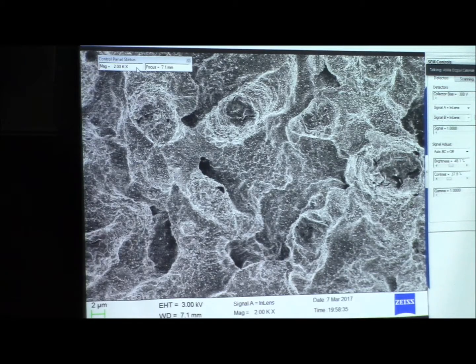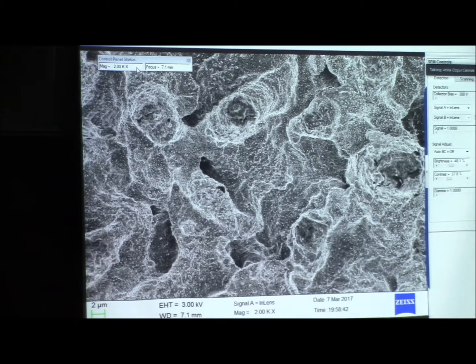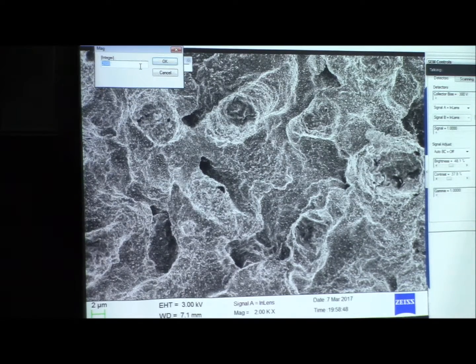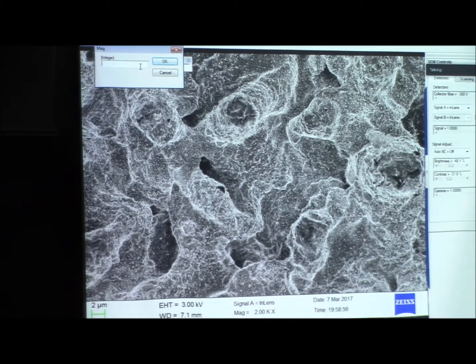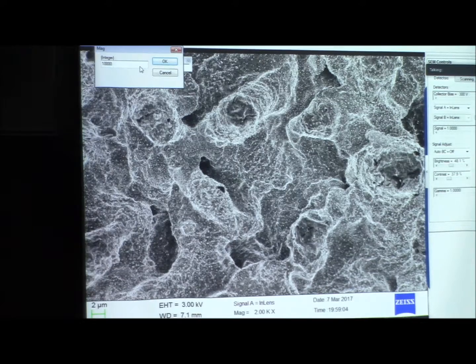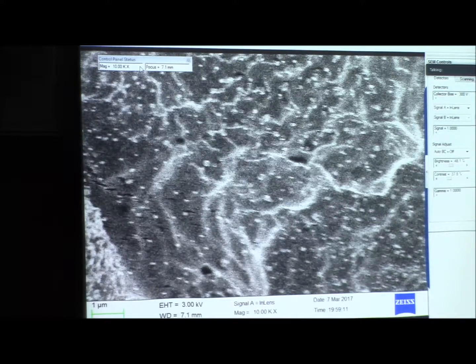Okay, we see something in there, right? Maybe, okay, let's try a bit higher. Let's try 10K, 10,000 X. Okay. We're not seeing it right in here.